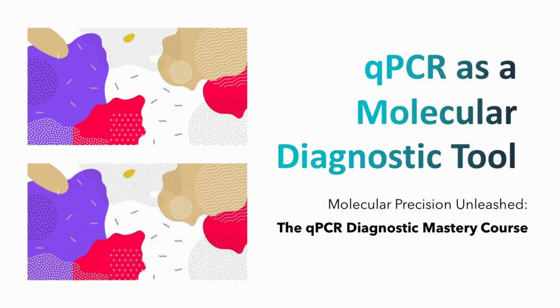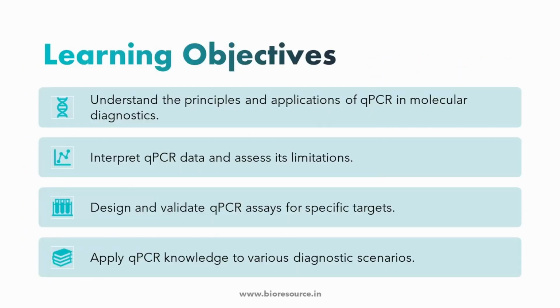Welcome to the course on qPCR Diagnostic Mastery, qPCR as a molecular diagnostic tool. The learning objectives are understanding the basic principles and applications of qPCR in molecular diagnostics, interpret qPCR data and assess its limitations, design and validate qPCR assays for specific targets, and apply qPCR knowledge to various diagnostic scenarios.